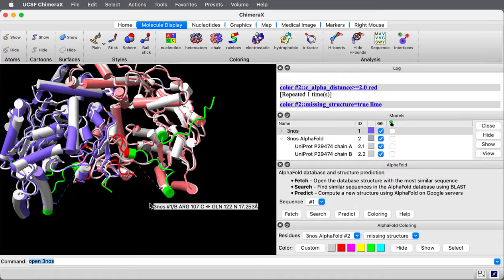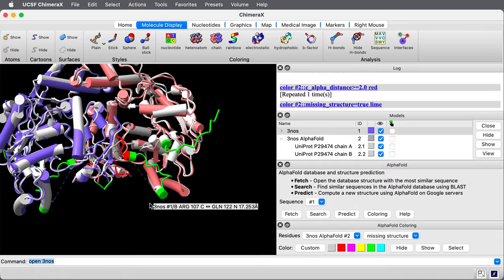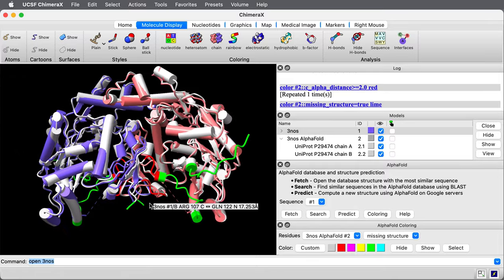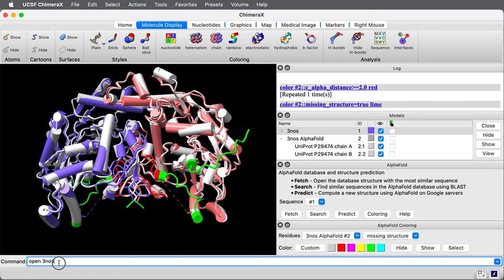Let's look at one more interesting thing that alpha fold can do for us, the alpha fold prediction. I'm going to load the full length nitric oxide synthase structure from alpha fold. It's not possible to do that with the panel here. It fetched the portion of the structure that matched the sequence in this experimental structure.